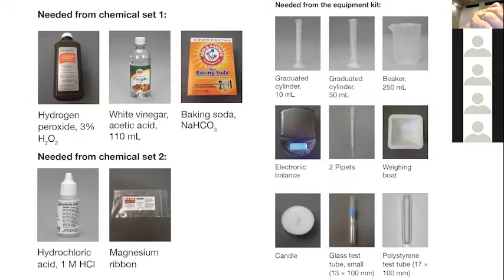We're going to need peroxide. That's a fun reaction. The peroxide and yeast is a good one. Vinegar. What are we going to be using the vinegar for? The steel wool. For the steel wool, what is it going to do?